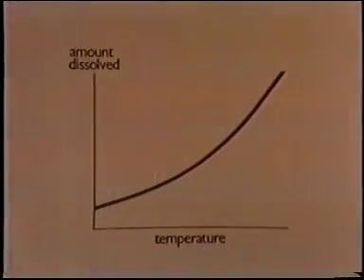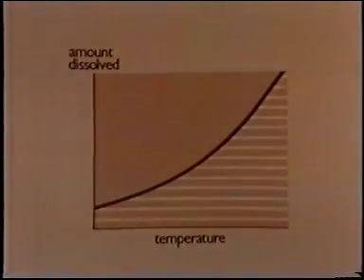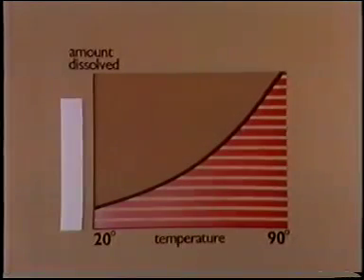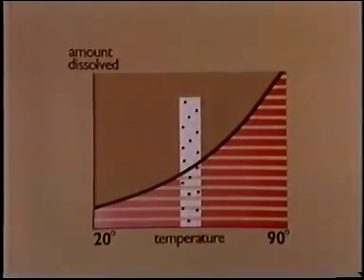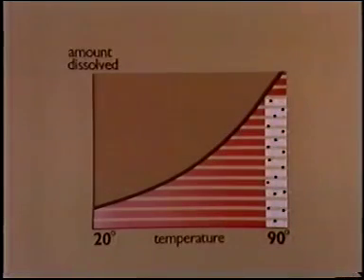Let's see why it is that recrystallization brings about purification. The line on this graph shows how the amount of solid that dissolves in a fixed amount of solvent increases as the solvent temperature is increased. The columns represent an impure solid in which the required material is contaminated with an impurity. At room temperature, some of the solid dissolves in the solvent. Heat up the solution, and more of both compound and impurity dissolve, until, at the boiling temperature of the solvent, all the solid has dissolved.